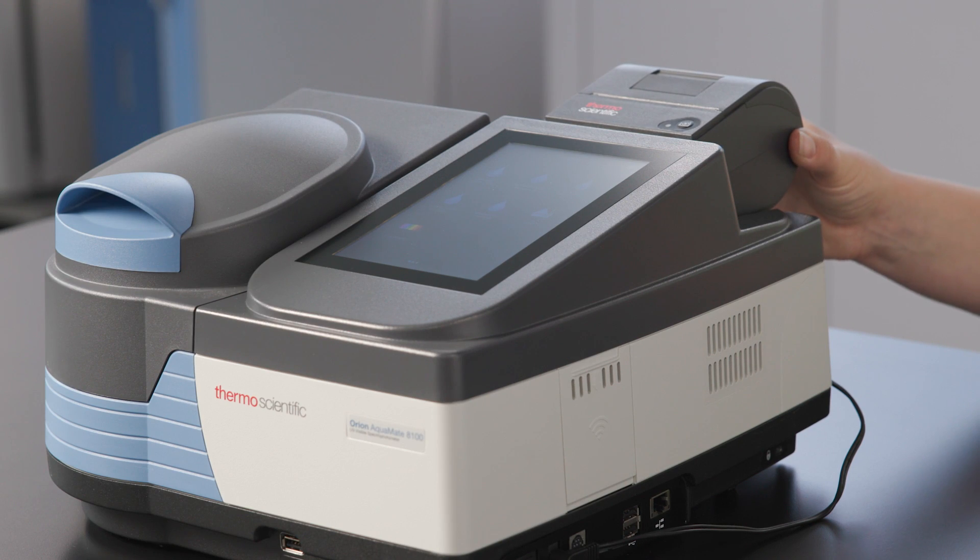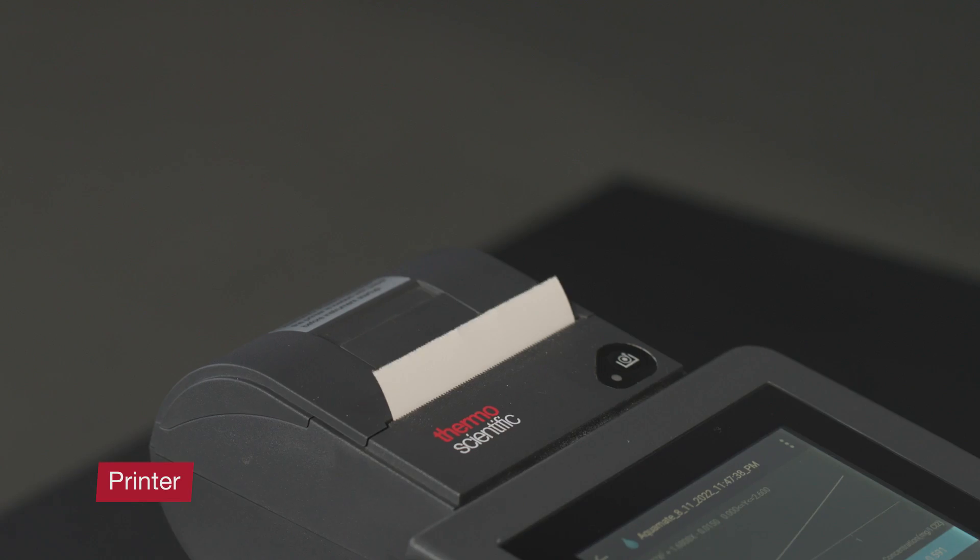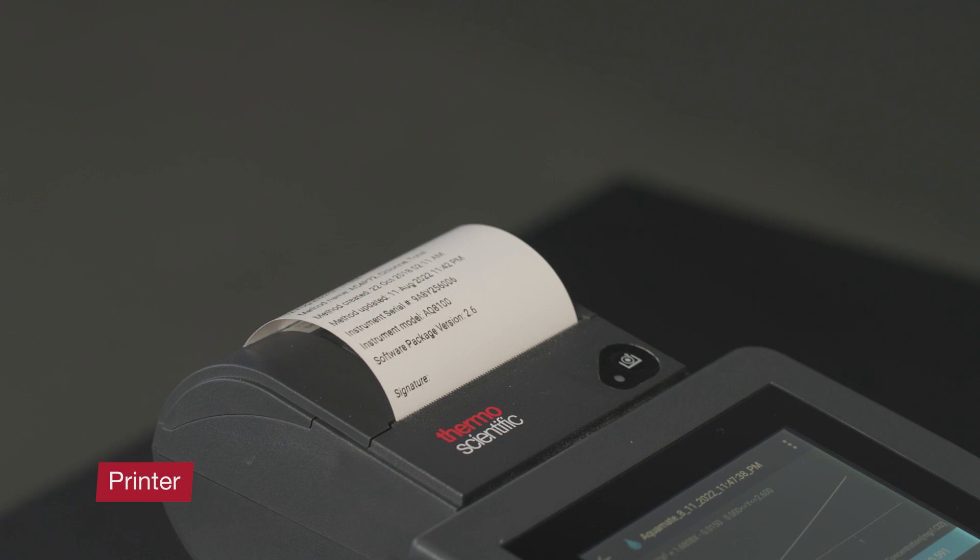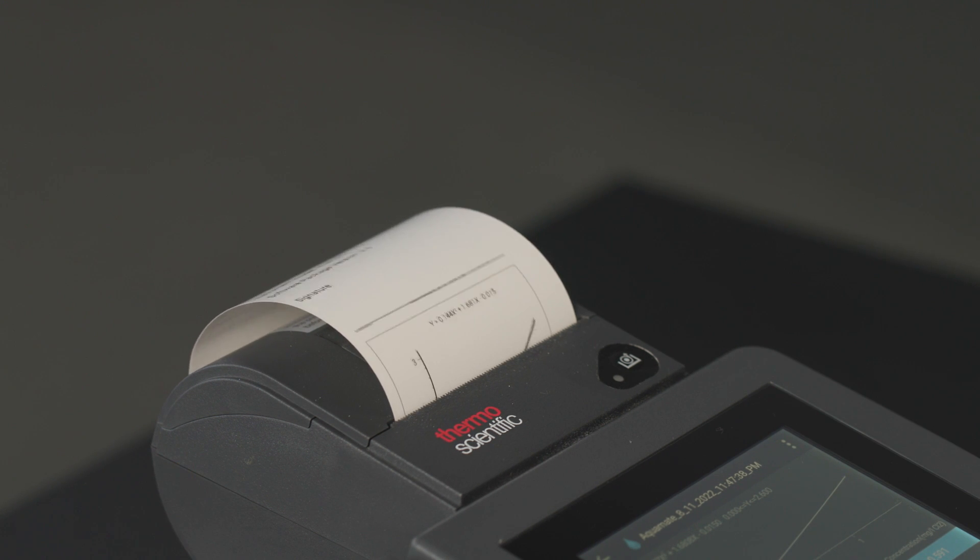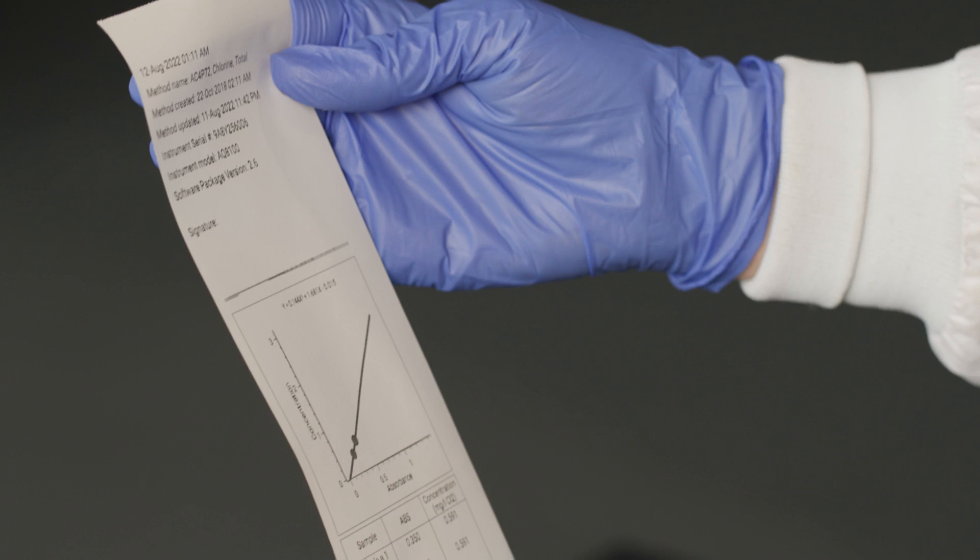We also added this integrated printer. This comes standard with the AQ8100 model and is an optional accessory for the AQ7100 model.